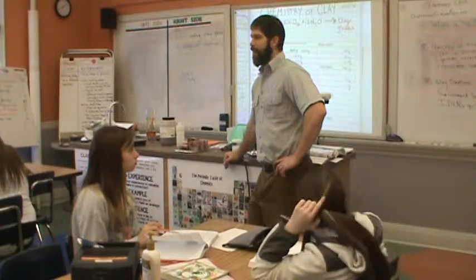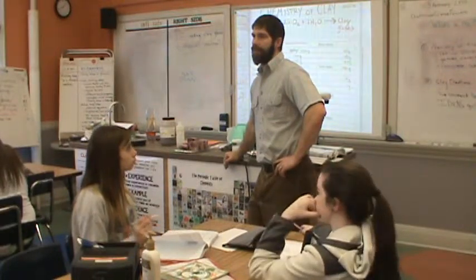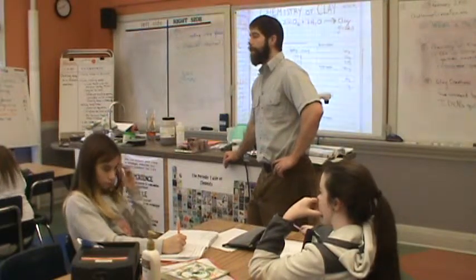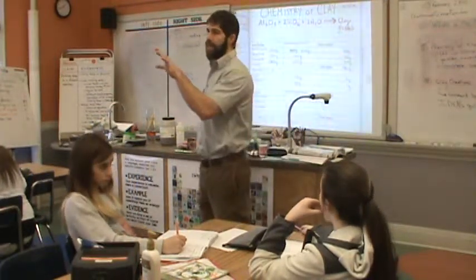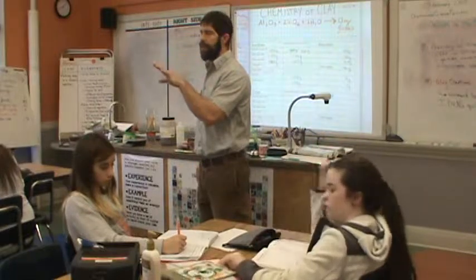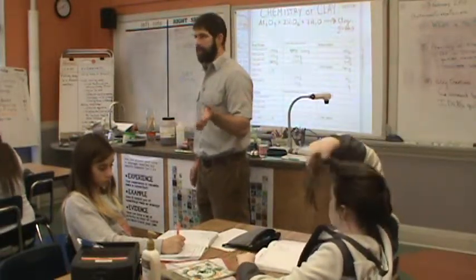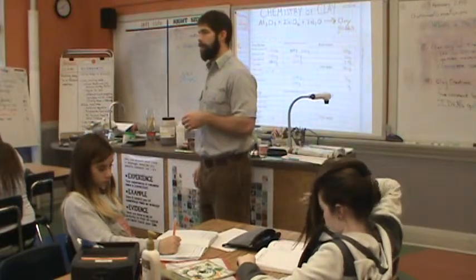Those working on the clay creations, you do not need your eyewear on, but those working in the back, you do. Be careful with the silica dioxide or silica oxide. You don't want to breathe that in for a long period of time. Not that anybody is, but just so you know.